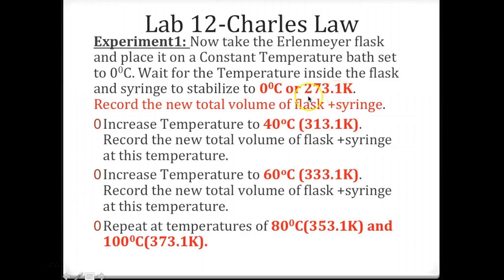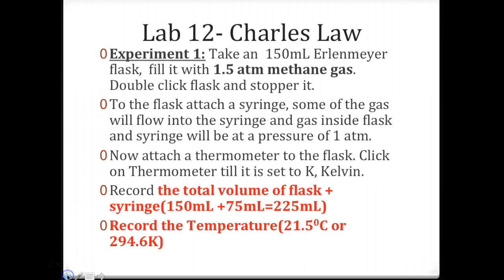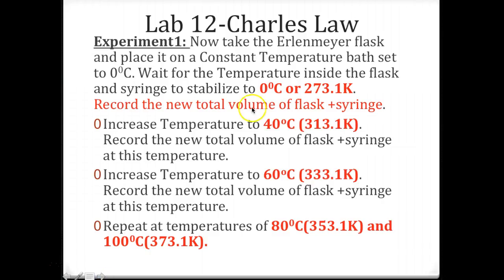You'll record the total volume of the flask and the syringe at this temperature. You went down from room temperature, around 21.5, equivalent to 294 Kelvin, to 273.